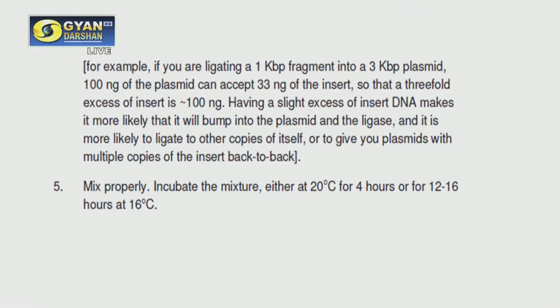What would be the insert molecule? Now here there is one rule. That is, the insert molecule should be 3:1 molar excess over the vector molecule. So you have to calculate the molar excess. Now what is meant by this molar excess? You have to understand that very clearly. Like I gave you an example here.